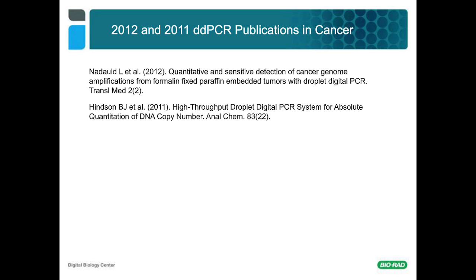Okay, so going back to the KRAS multiplex assay, is there a way we can validate the individual assays within the multiplex? Each of the assays that are in the multiplex are sold as individual duplex assays on the Bio-Rad site. Those assays are also pre-validated on the wet lab bench. You can download all the validation data straight from the website.